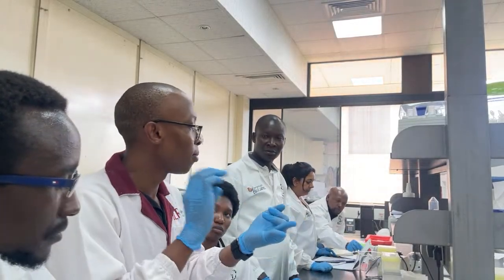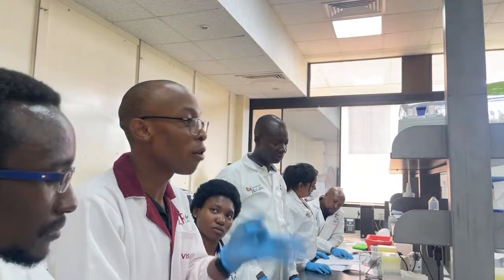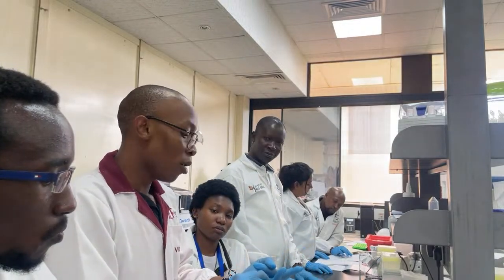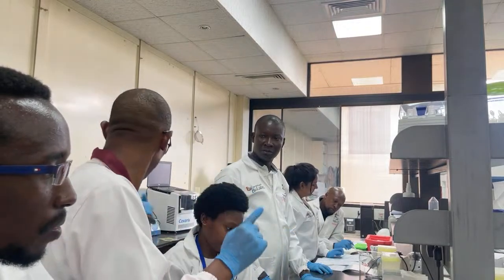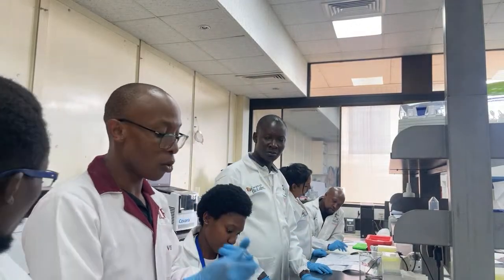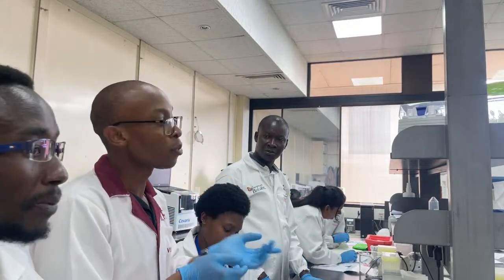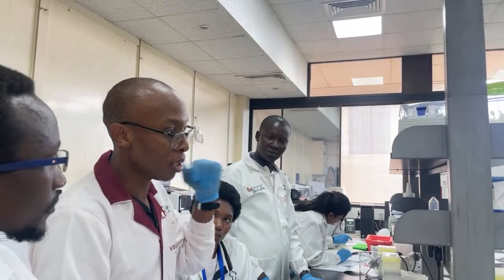Nanodrop, TapeStation, Qubit. Those are your first three instruments for your initial QC. Once you've done the shearing and everything, it's always a Fragment Analyzer or TapeStation and Qubit. Those two all the way. The Nanodrop helps because if the run fails down the line, I'm going to come back to you and ask for the initial purity checks that you did. So I need that Nanodrop for that.